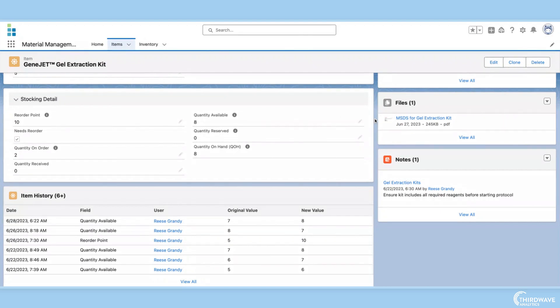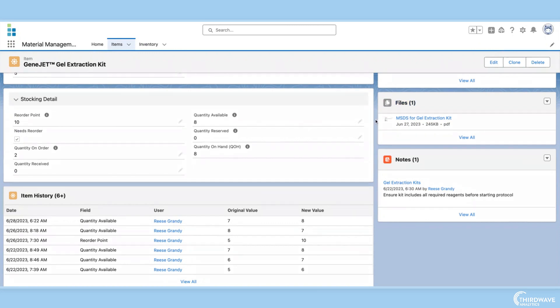If your lab has documents or certificates that need to be saved and stored, such as material safety data sheets, users can upload them and associate them to specific items or inventory records via the file section.